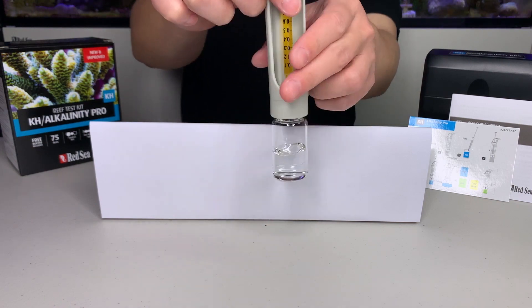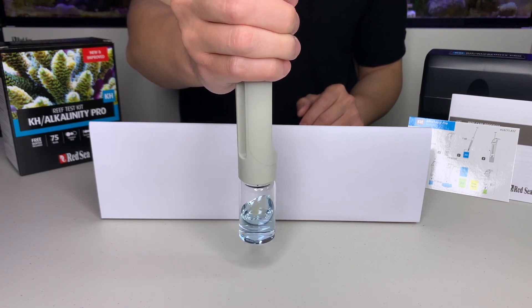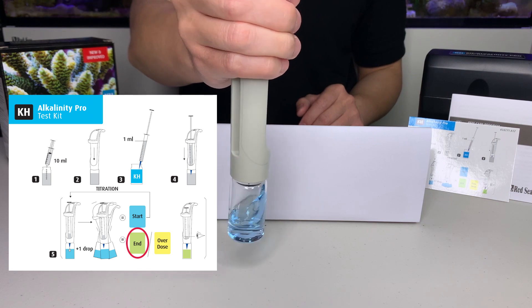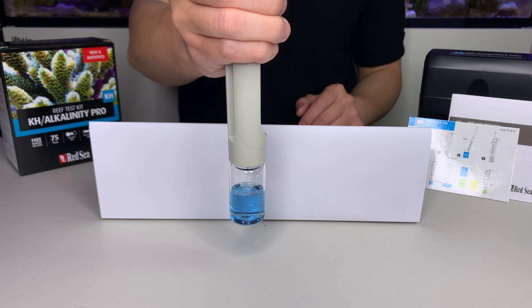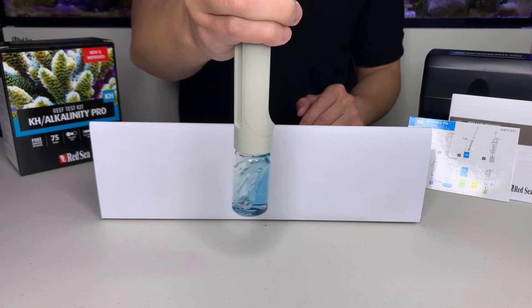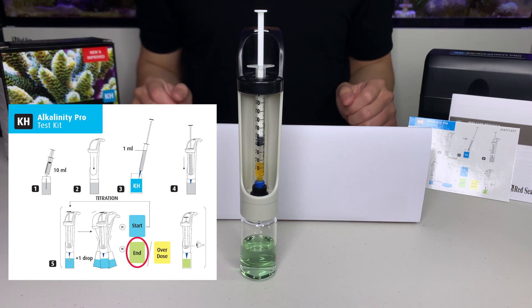Now we start doing the titration by slowly adding the titrant into the vial and shaking it at the same time. As soon as you start adding the titrant, the water sample will turn blue. We are looking for a color change from blue to green. Now we can see the water sample is turning into a deeper blue color. We will slow down and only add one drop at a time. Now we can see the water sample has turned green, like in the instruction card provided with the kit.